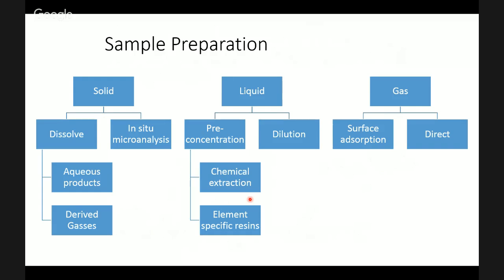Okay, so those are mass spectrometry type problems, but we also need to think about what we're doing to the sample before it goes into the mass spectrometer. So quite a lot of geological samples are not really suitable for putting straight into an analytical instrument. Sometimes they are, but quite often they are not.